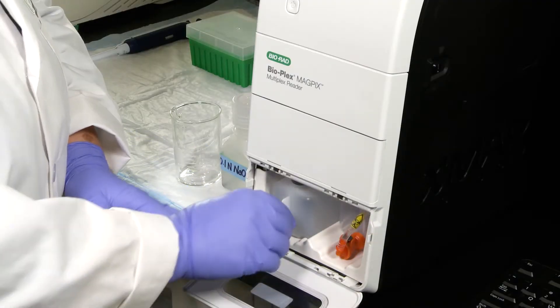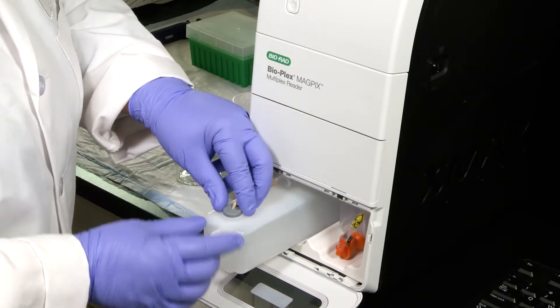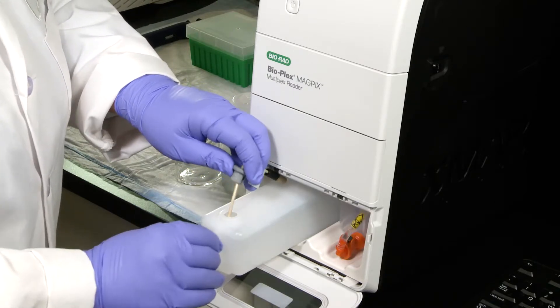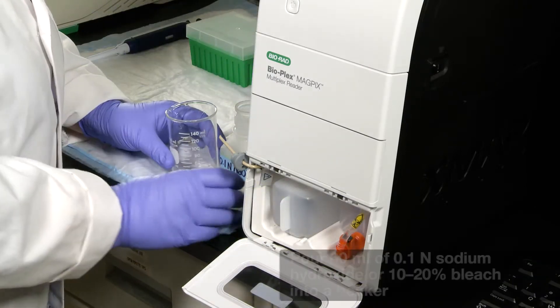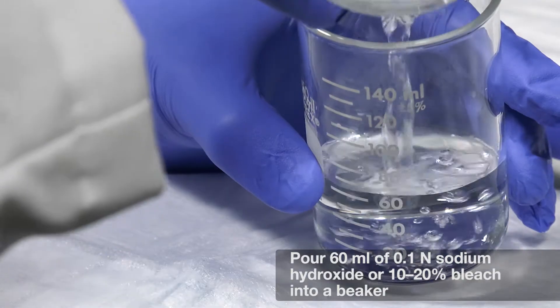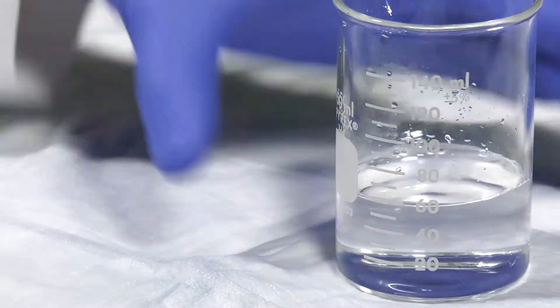Pull the drive fluid compartment door down to access the drive fluid bottle probe, which is on the left. Make sure that there are no salt deposits blocking the vent hole and ensure that you can see through the grommet vent hole. Pour 60 ml of 0.1 normal sodium hydroxide or 10 to 20% bleach into a beaker or disposable reservoir. Usually, one prime routine uses about 6 ml of liquid.